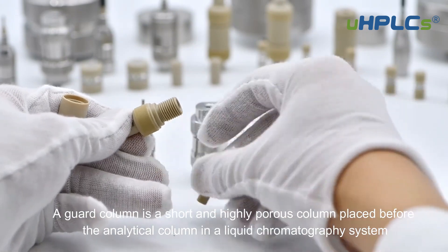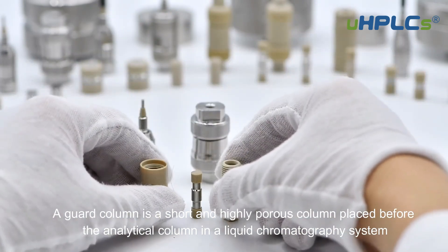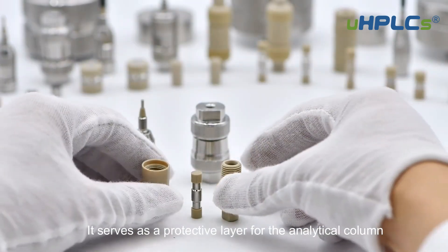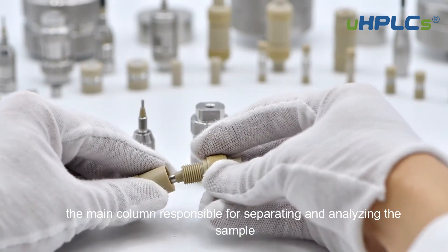A guard column is a short and highly porous column placed before the analytical column in a liquid chromatography system. It serves as a protective layer for the analytical column, the main column responsible for separating and analyzing the sample.